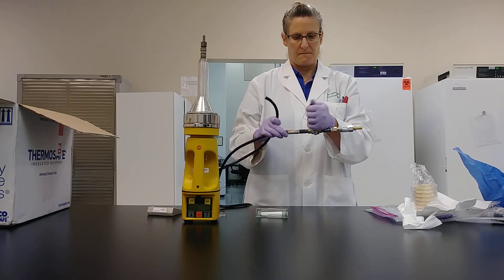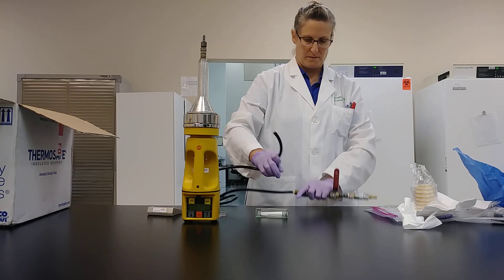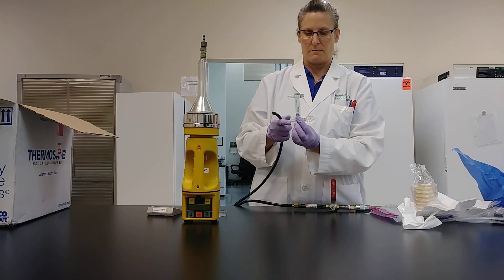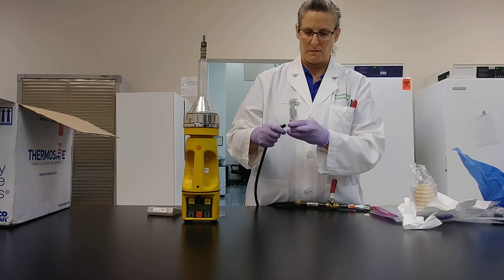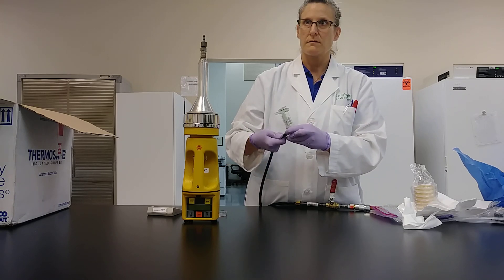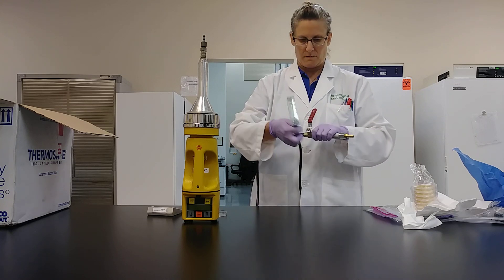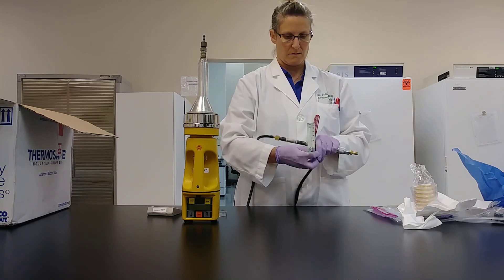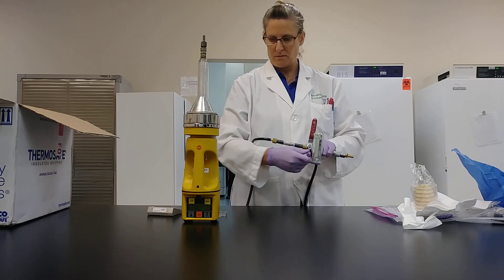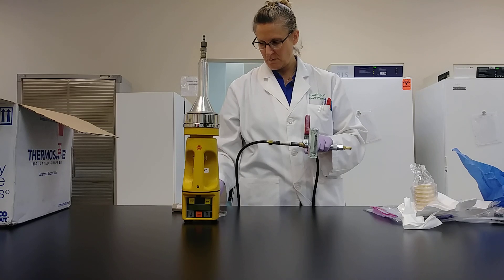After 60 seconds, turn the air off and now attach the other end of your connector tubing to the bottom port of your flow meter. You'll be sampling at a rate of 100 liters per minute. At this rate, 10 minutes of sample time will result in a cubic meter of air sample. Set your timer to 10 minutes.